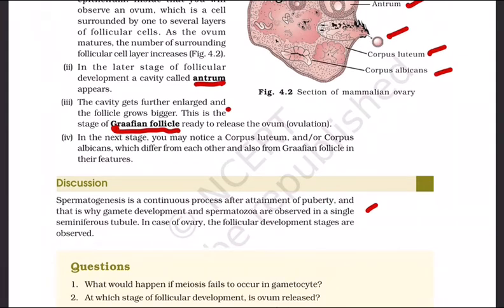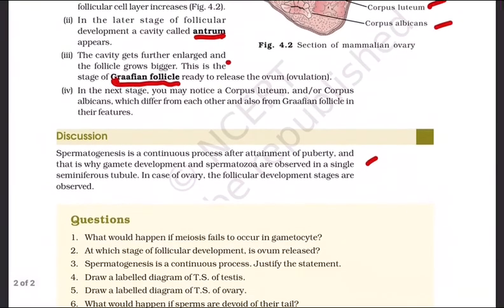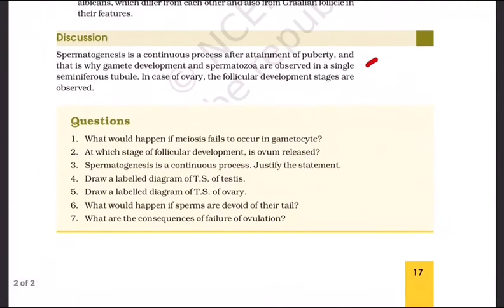First you have to write, the given slide kept under the microscope is Ts of ovary. Second you write, it is Ts of ovary because the following features have been observed by me. First, I have observed the various follicles: primary follicle, secondary follicle, tertiary follicle, Graafian follicle. Then you write, a lot of blood vessels are observed, and then corpus luteum is observed, release of ovum, the breaking of the Graafian follicle, antrum. You have to write point-wise, and hence it is Ts of ovary.